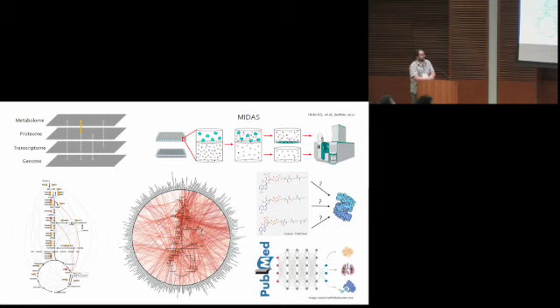So this is called Electrum. And I think, so when we think about a metabolic pathway, a lot of the times we think of it very linearly, like substrate A is catalyzed by enzyme A and it turns into metabolite B. But we see that when we overlay the Midas data on the central carbon metabolism pathway, we see that it's not just this linear pathway.